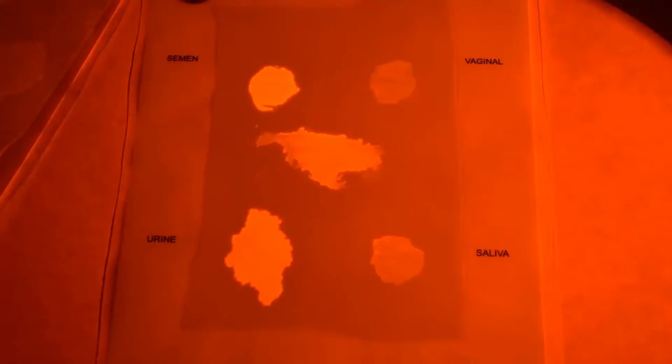All body fluids, except for urine, must be dry to fluoresce. It is possible sometimes for urine to fluoresce when wet.